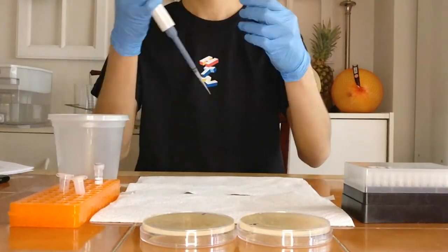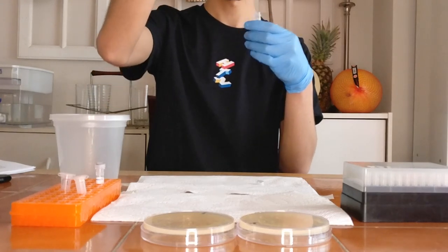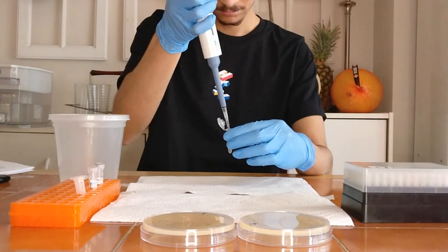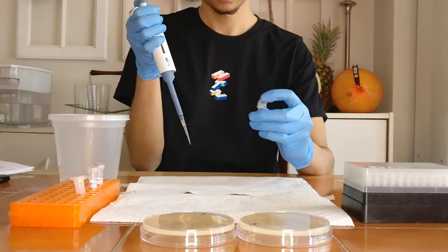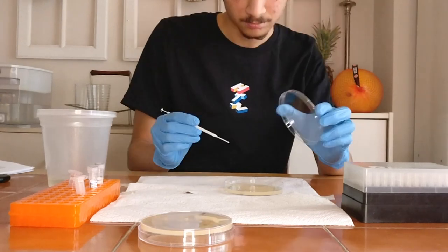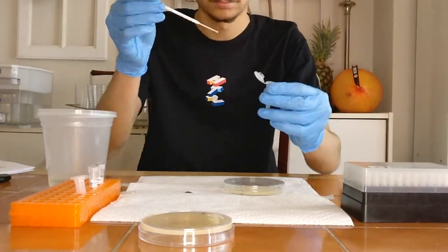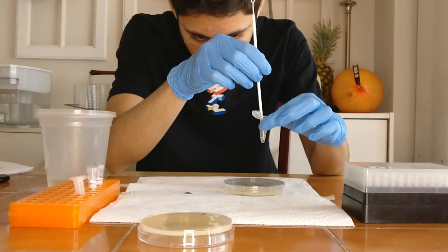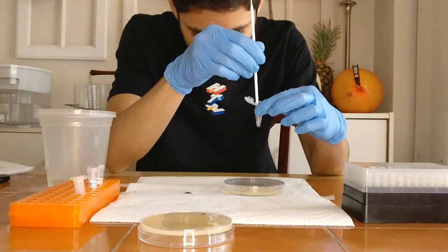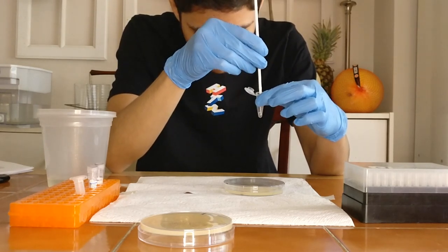Now it was time to prepare some competent bacterial cells. These are cells that are able to take in foreign DNA. To achieve this, I added some polyethylene glycol and calcium chloride to an empty microcentrifuge tube. I then scooped up some bacteria I had from the plate before and added it to the tube. It was a little bit tough to get the bacteria off the actual inoculation loop, but I got there in the end.